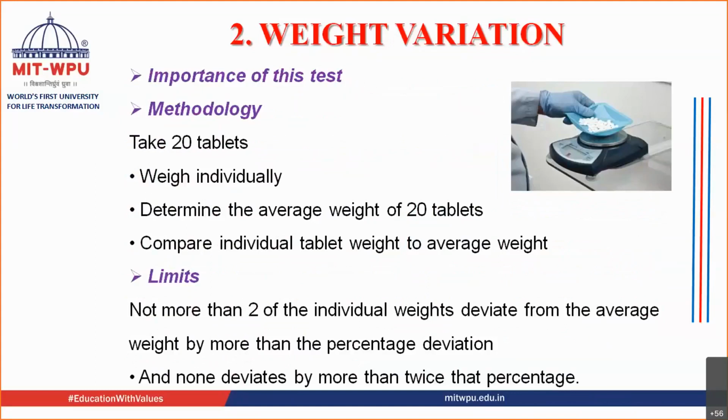The test that you are going to carry out is about the weight variation. Now, what is the importance of this test? The weight of the tablets is directly proportional to, or is directly going to affect, the content of the tablet.